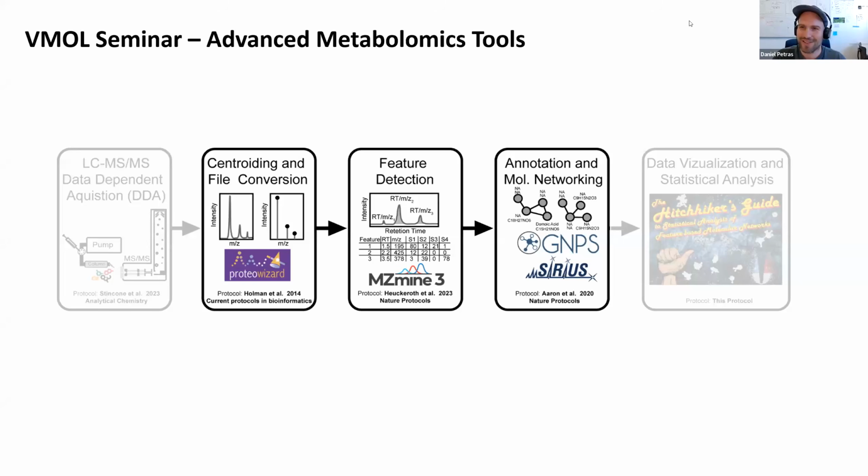Awesome. Thank you so much, Alegra, for this great intro on especially the hardware and data acquisition part. So now, the other part of the seminar series obviously deals with the data and particularly some state-of-the-art annotation and statistical tools that we might want to focus on. And I think one of the mainstays for us has been molecular networking.